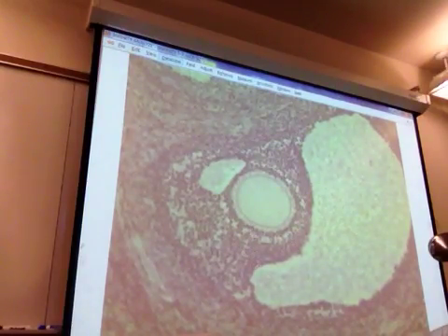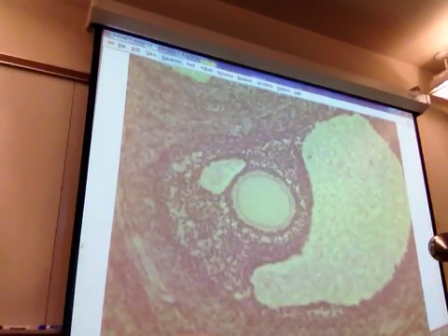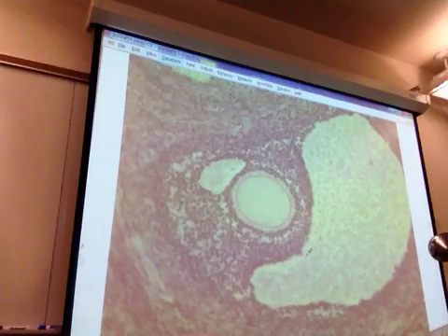So I'd be like, what cells are in this structure? And then I'd outline the whole thing like this. And the answer would be theca and? If I said what cells, you'd say theca and granulosa cells. If I said what is this structure, you would say corona radiata.